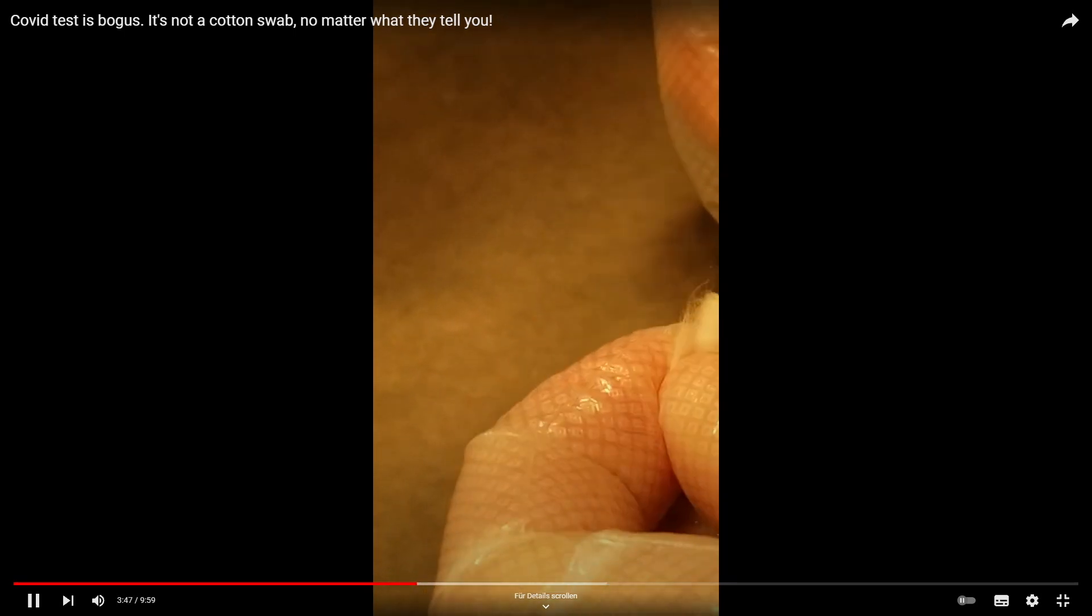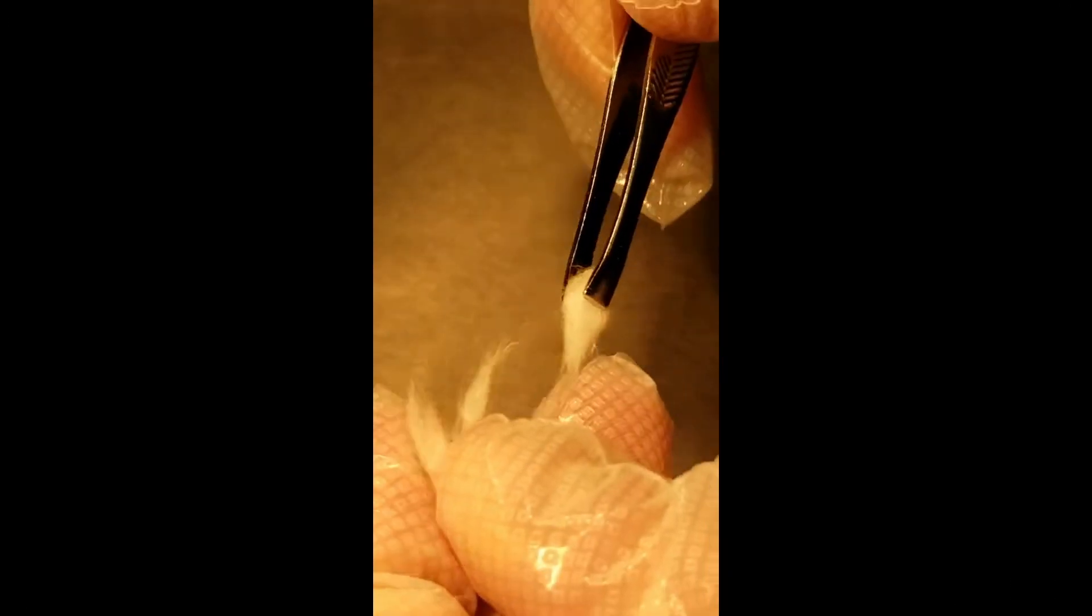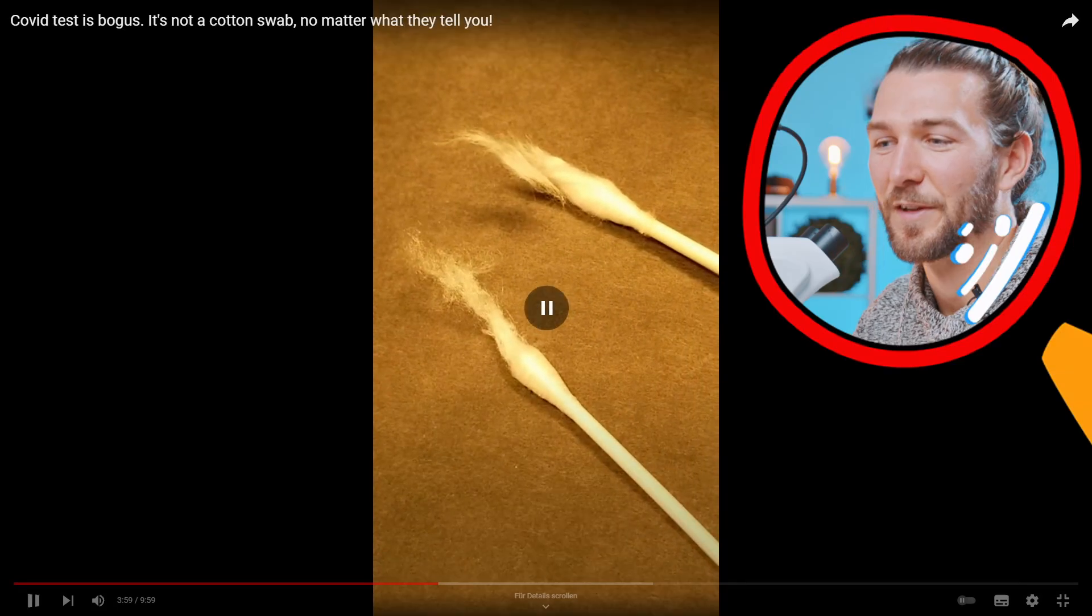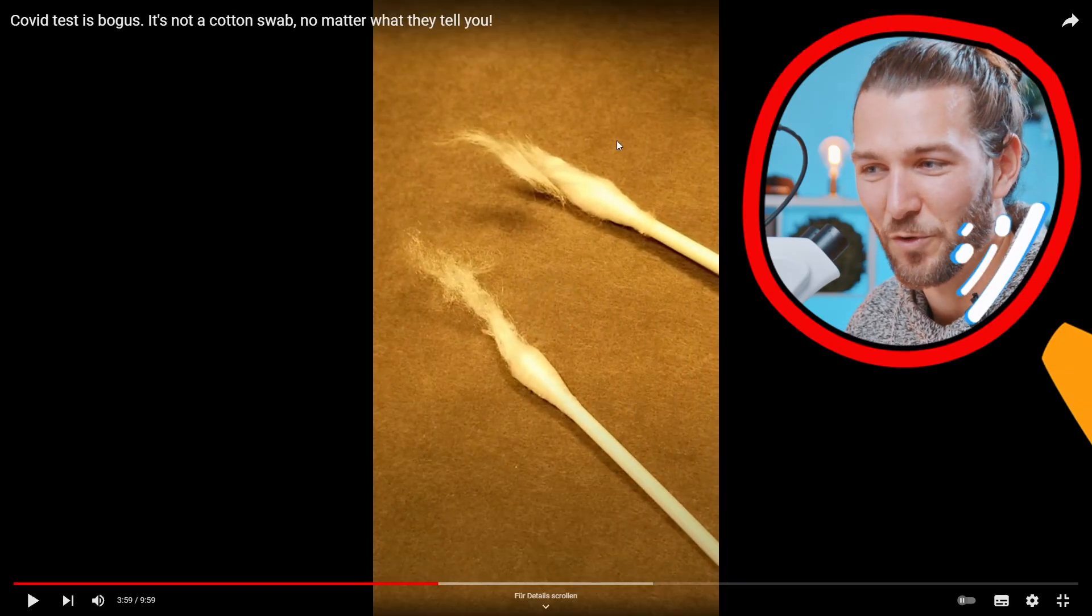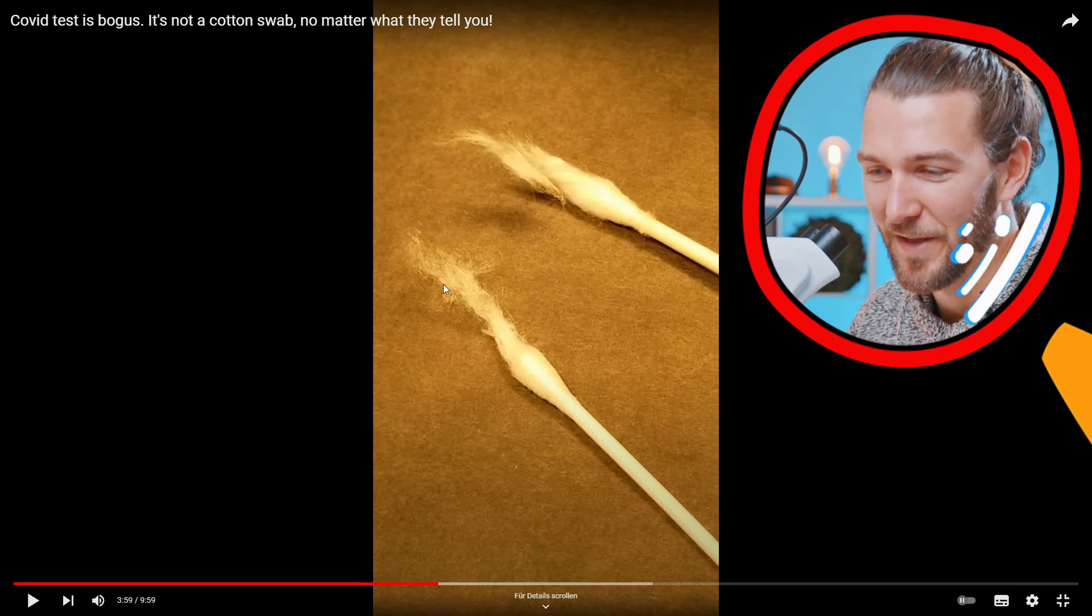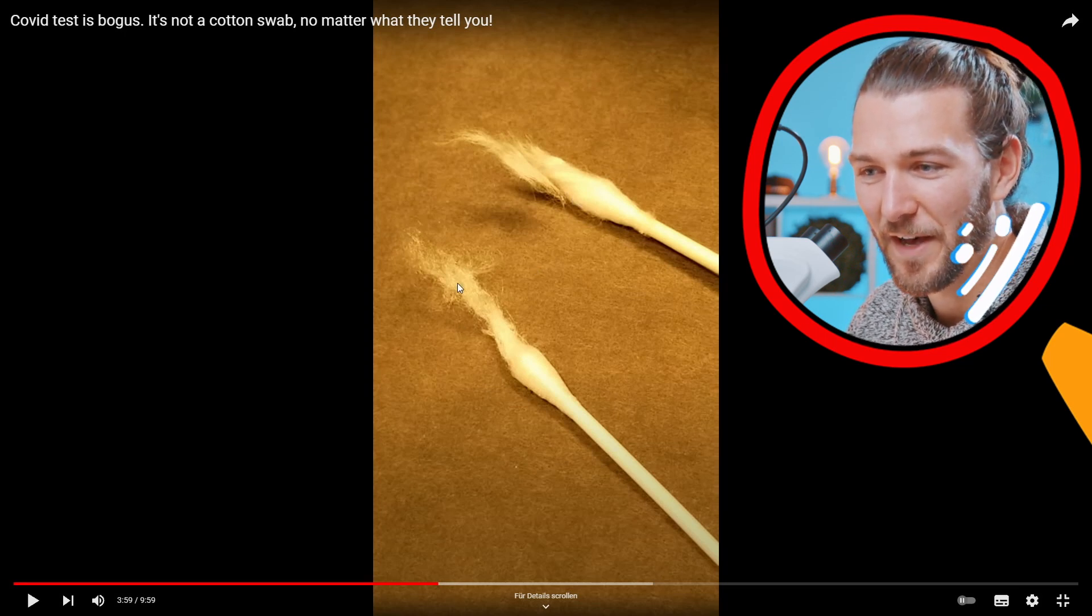Yeah, what's happening here? So you can see I'm just pulling this apart. See the Q-tip, there's really nothing going on with the Q-tip. It's just not cut and it's not moving at all. But if you now, we're put, okay so on the right side here this is the normal cotton swab, and the Q-tip here of the COVID test is much more fine in structure.